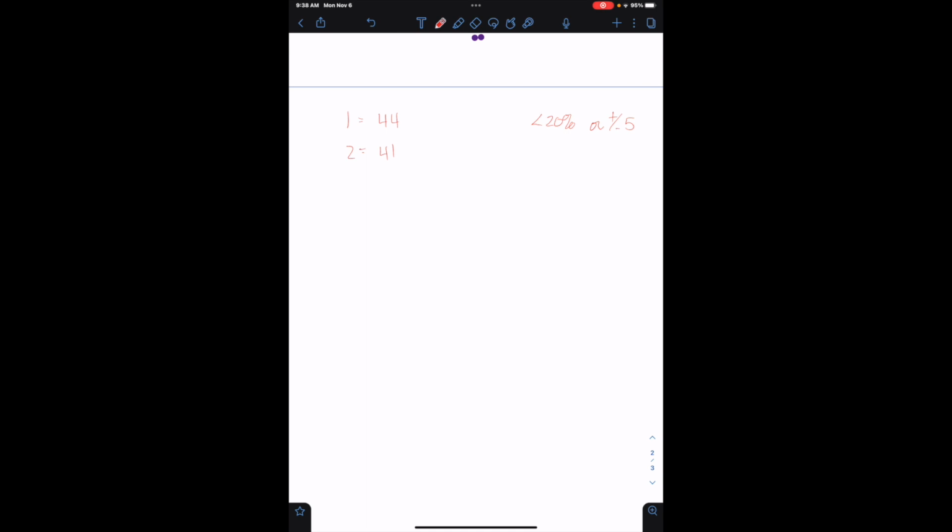Now, the next thing we're going to take a look at is our actual count for WBCs. In order to report this, it's number of cells per microliter. The calculation for that is the average number of cells times any dilution factor, and that is all divided by the number of squares counted, divided by the volume of one of those squares, 1 square. So we'll put that on there.